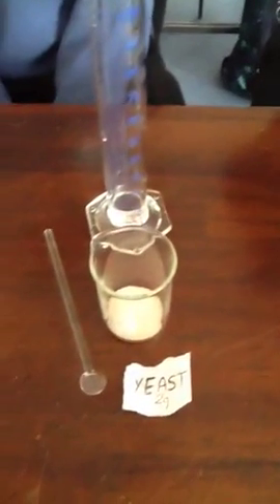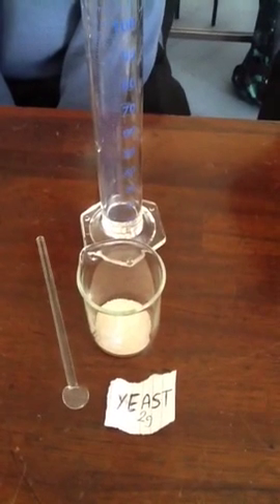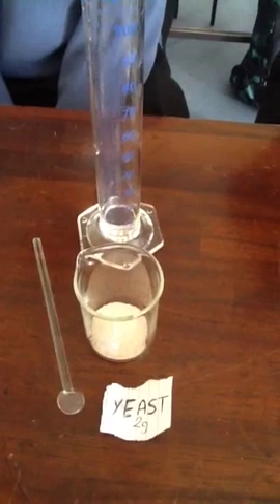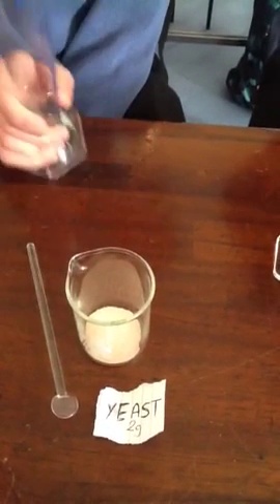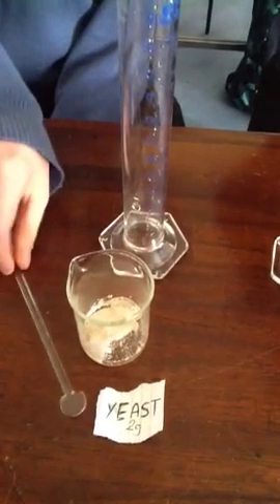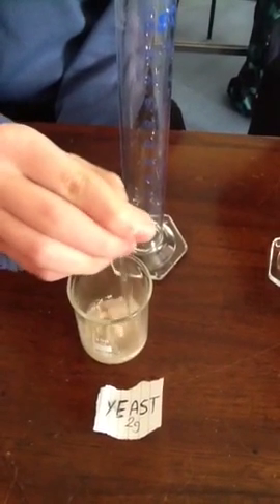Benedict, you have weighed out 2 grams of the yeast, which contains the enzyme zymase. So what are you going to do with that now? I'm also going to add 10 centimeters cube of water. I'm going to stir it and dissolve it. Put your stirring rod in.